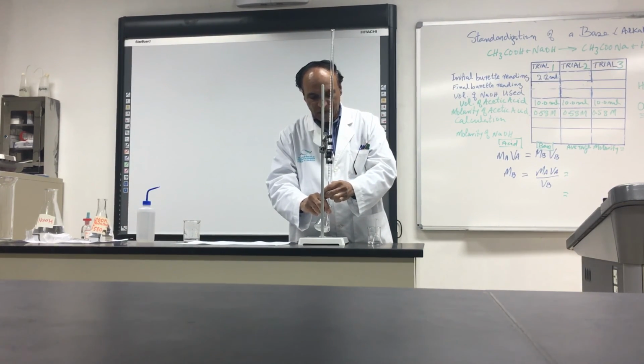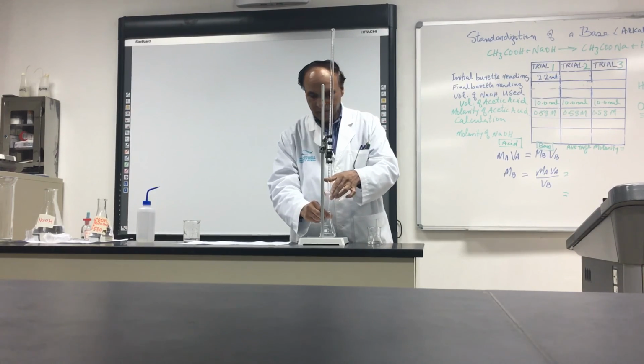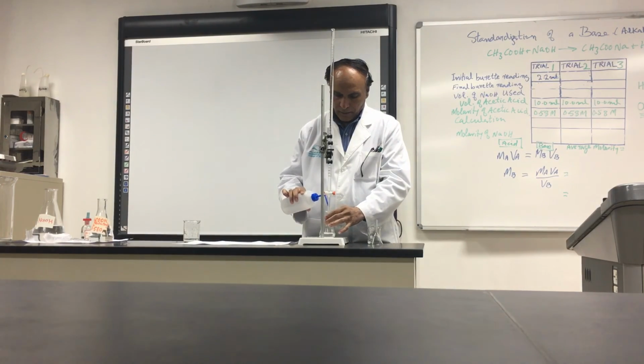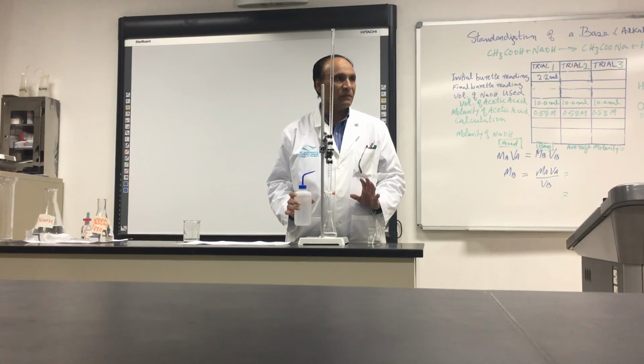If something touches the flask, look, if something touches the flask, put some water. Because water does no problem, it will not change your readings. You can put it on the wall to bring it down.